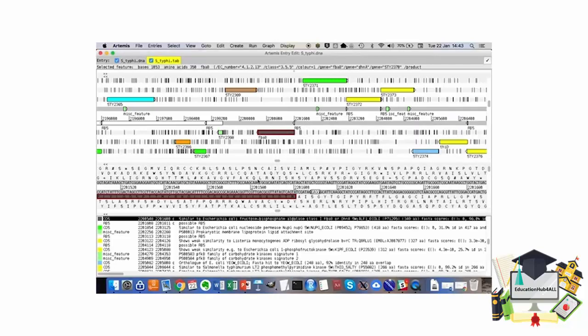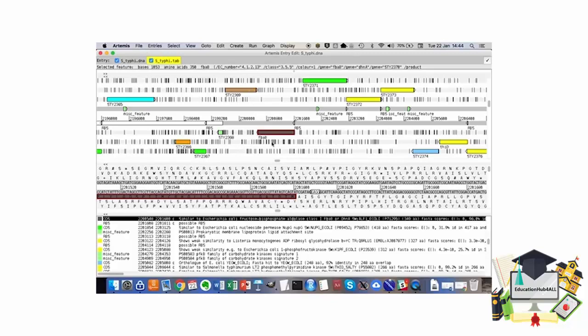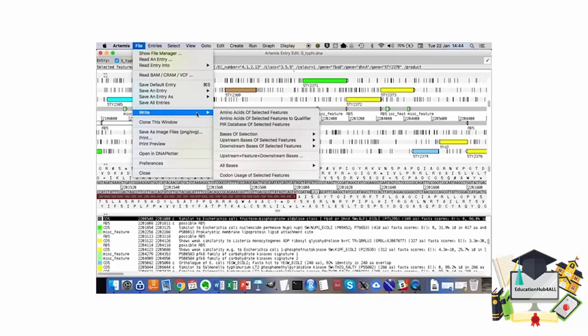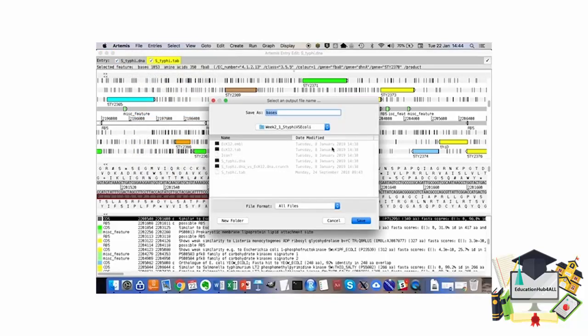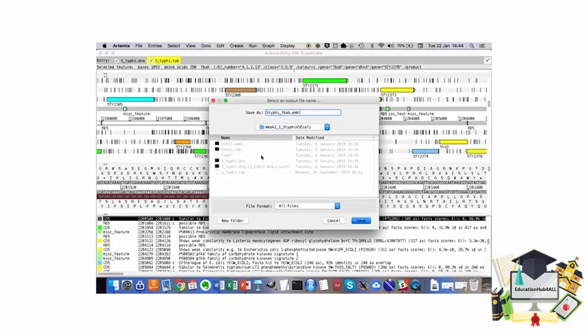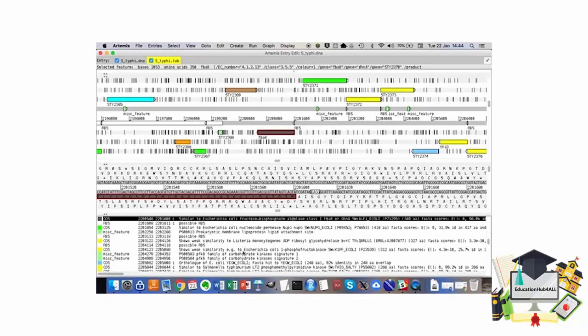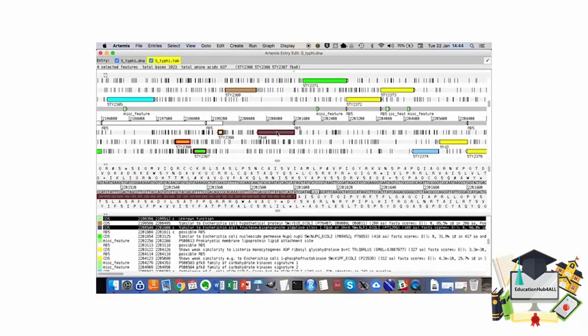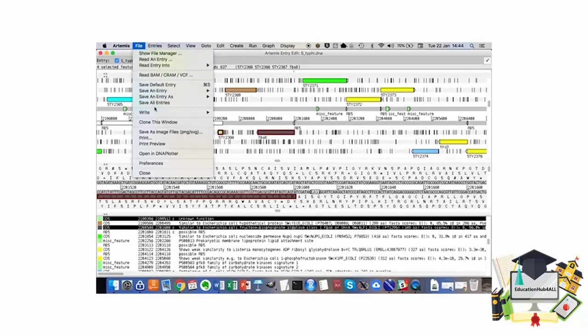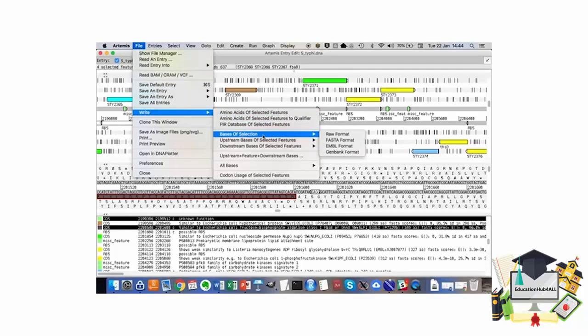If we wanted to save this sequence to a file, we can either do it as I showed before, or with a highlighted feature, go to File, Write, Write Bases of Selection as FASTA, EMBL, or GenBank format. I want to choose EMBL format. So here I can say S_typhi fbaB gene, and I am going to put the extension EMBL so I remember that I saved this as an EMBL file. I can then navigate to that location and open the file if I want to. You can also save more than one at the same time by selecting four features.